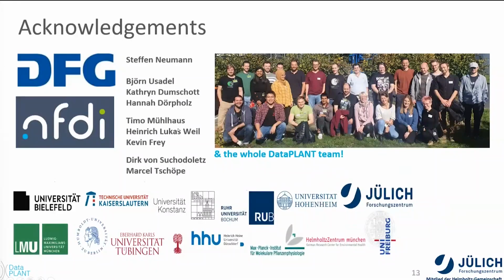So, and of course, this was not done by me alone. So I want to thank some people, especially Steffen, who reached out to us and also inspired us for our review paper. The ontology curation and also taking care of adding new terms is done in Jülich by our team.